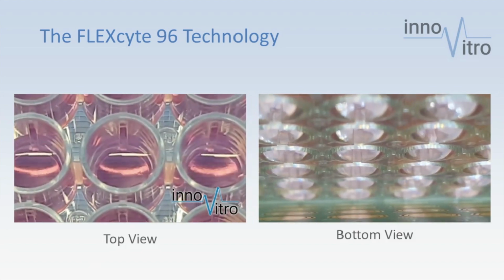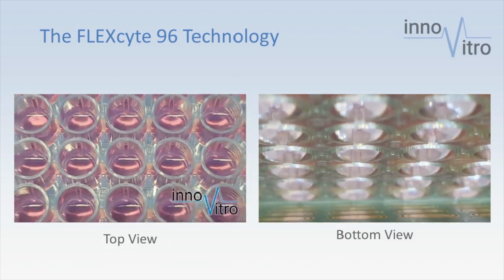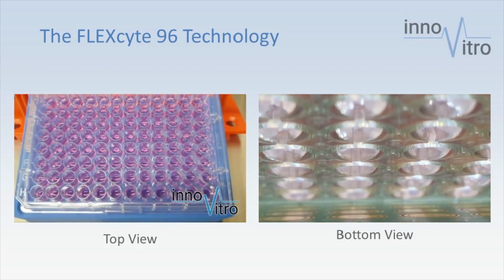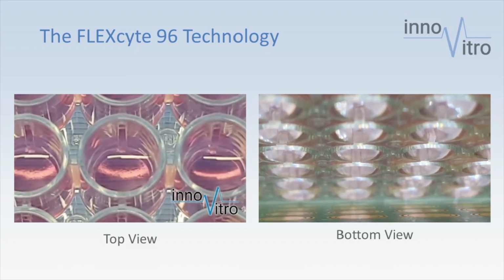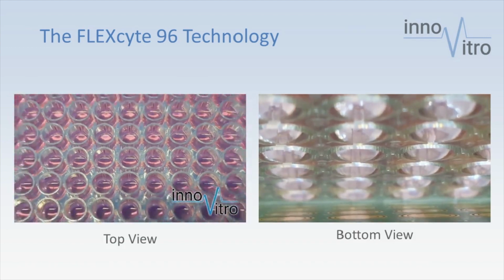So here on this slide, you can see how it really looks like. On the left side, you see the top view of the 96-well plate seeded with iPS-derived cardiomyocytes. You can see the membranes go up and down with your naked eye. And on the right side, you see a bottom view. And there you can also see the membranes moving up and down.